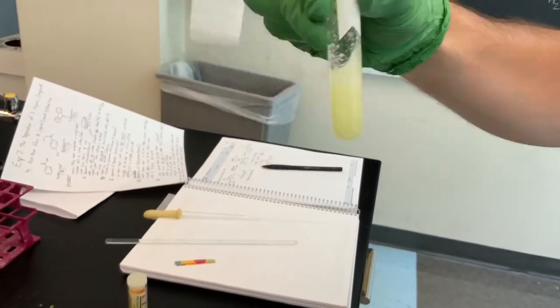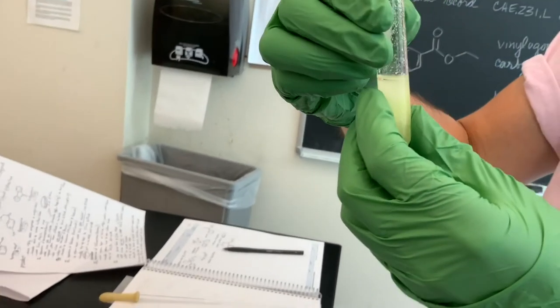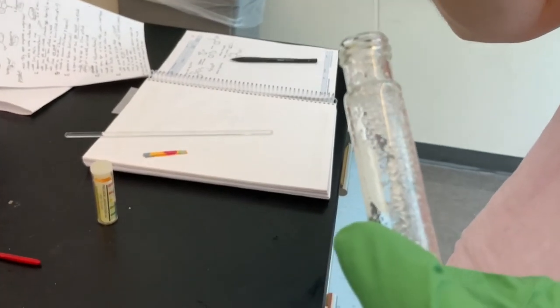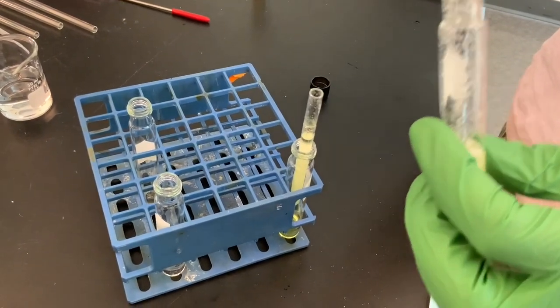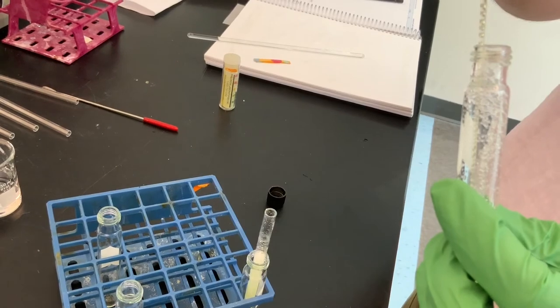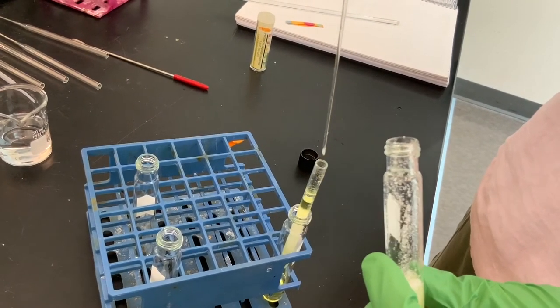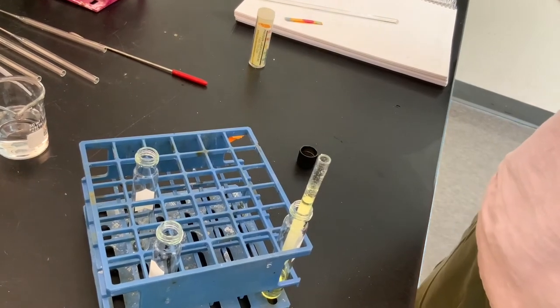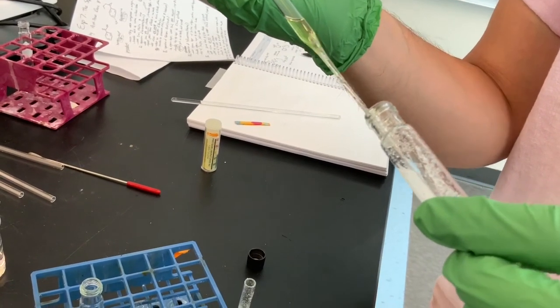So I'm trying to mix it around a little bit, and you can see that the yellow color is becoming more dilute. But we really overloaded it with sodium sulfate. First round. So we're rinsing that sodium sulfate and also the sodium sulfate that's in the column itself. Try not to break the glass of the Pasteur pipette or choke my Pasteur pipette again. That we already filled. Tilting it this way hopefully helps.